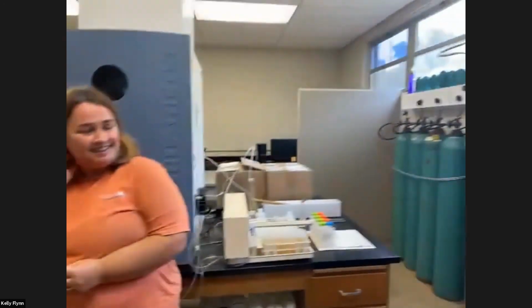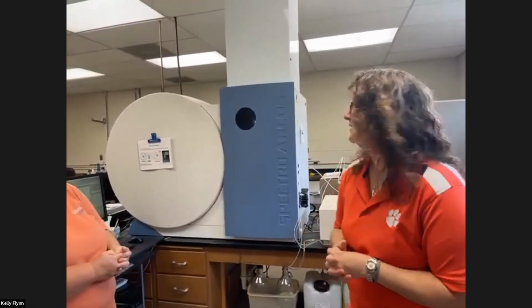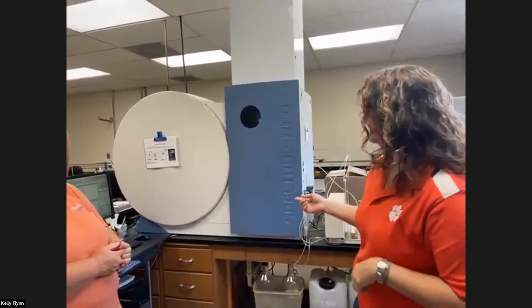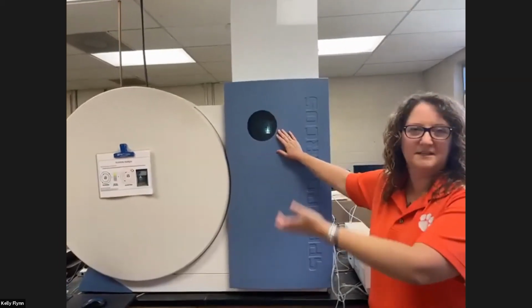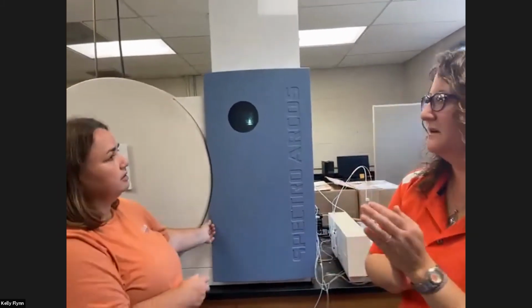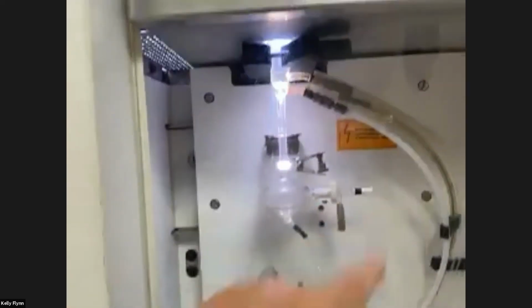I think something that's interesting about this that you might not see in another lab even is the plasma torch that Amy mentioned. So I know this is a little nerding out, but it might show up on your video as well. But this is actually generating the ions that are then counted to get these results. So you can see some of the inner workings. Yep. That nebulizer that's over here.